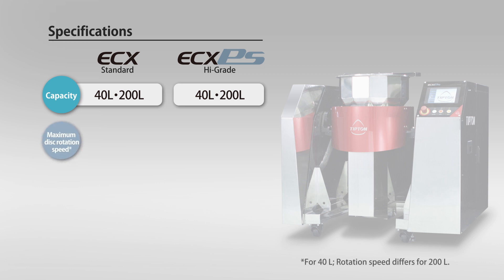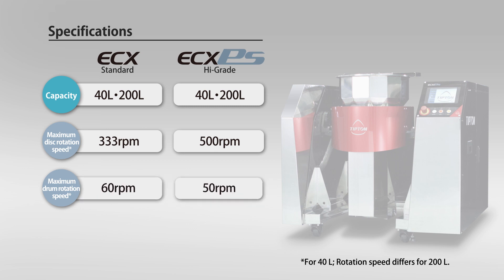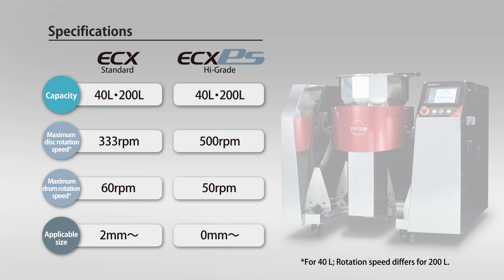Regarding the disc rotation speed, compared to 333 RPM for the standard type, PEAS is capable of high-speed processing at 500 RPM. On the other hand, the drum rotation speed is about the same at 60 RPM for the standard type and 50 RPM for the PEAS. While the standard type handles input items of at least 2 millimeters, PEAS can handle fine particles from 0 millimeters.